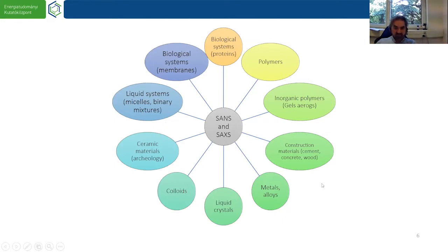So all these things in principle can be measured by other tools or techniques, first of all by electron microscopy, but it's important to remember that electron microscopy gives a static picture, and very often you need to process the sample, so it is not the native state of the sample very often, especially for biological or for liquid kind of systems. Let's go further.